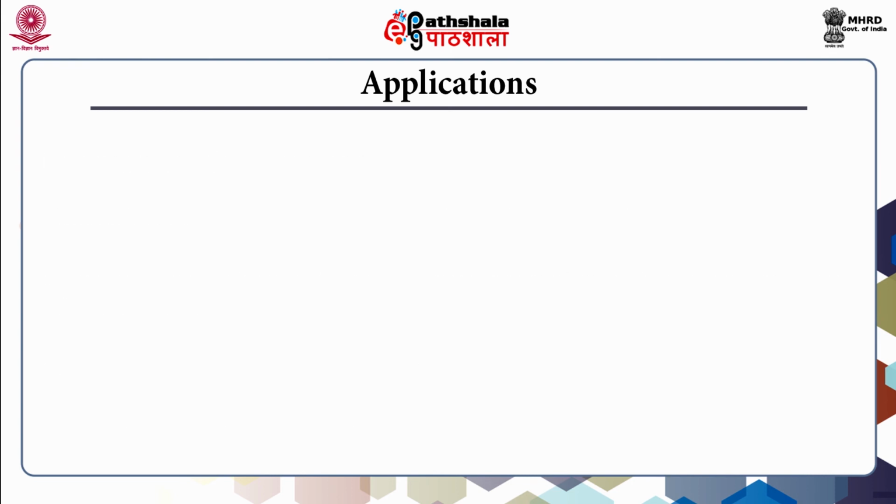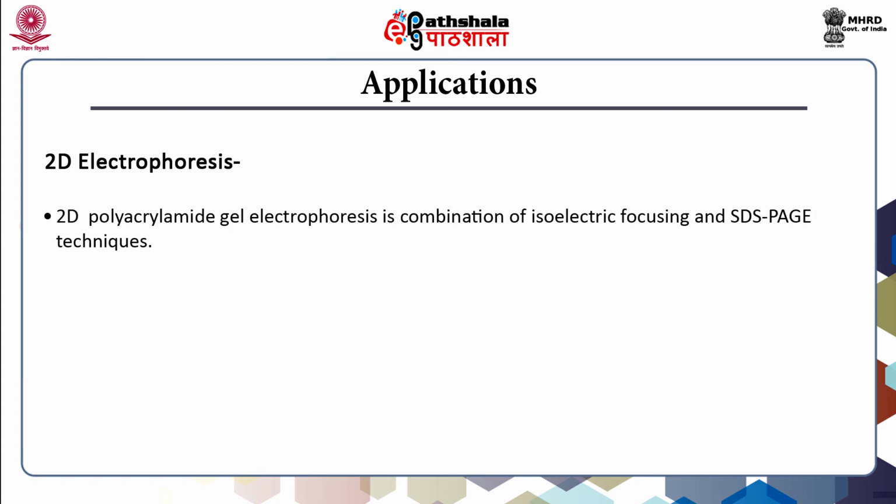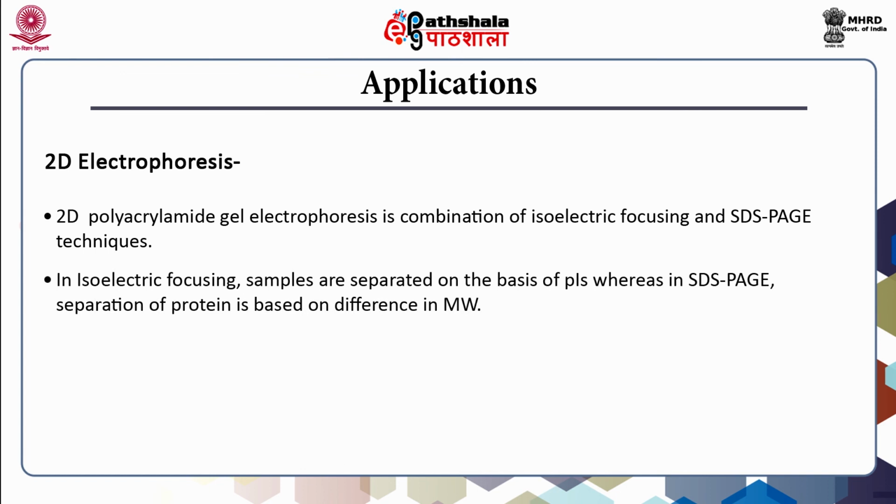Another application of isoelectric focusing is in two-dimensional electrophoresis. This is a combination of isoelectric focusing and SDS-PAGE techniques. In isoelectric focusing, samples are separated on the basis of isoelectric point, whereas in SDS-PAGE, separation of protein is based on difference in molecular mass.